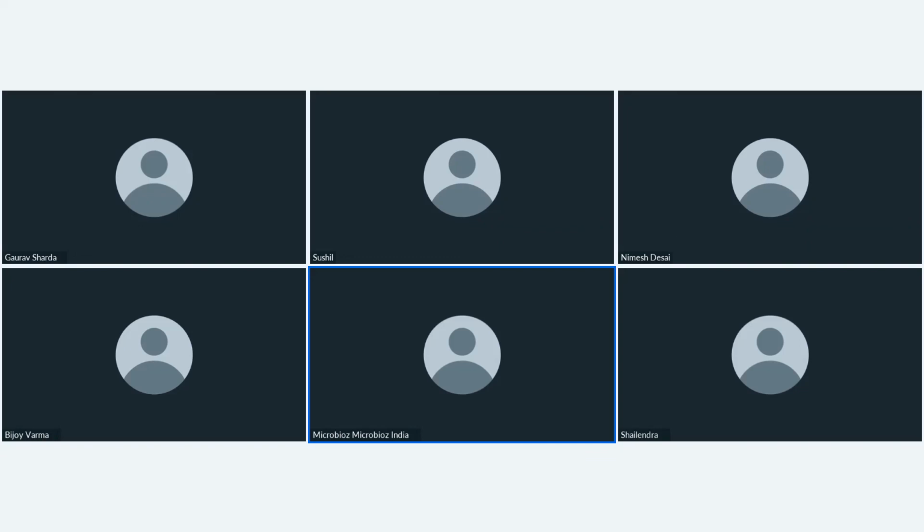As per guidelines, what will be the exposure time in different classes of area during plate exposure? For that, you need to validate first of all, but the basic industrial practice was 4 hours only, not more than 4 hours. But whatever the 4 hours you are claiming, you need to validate it.